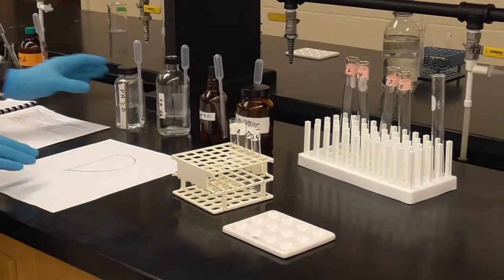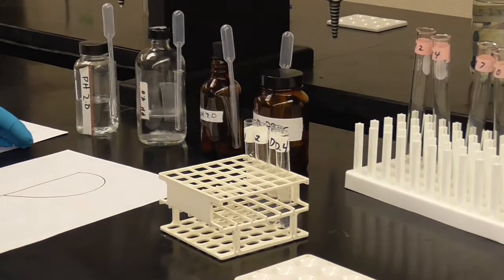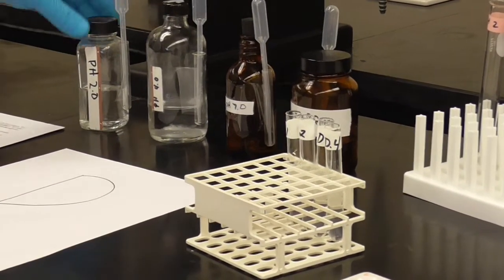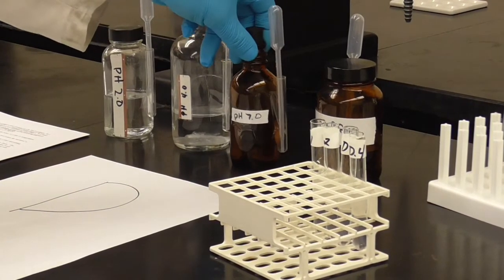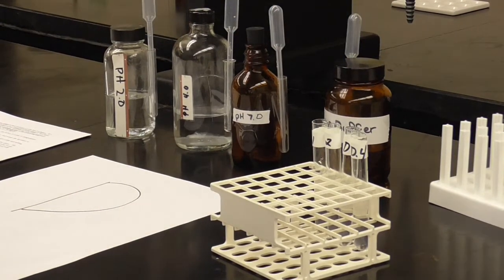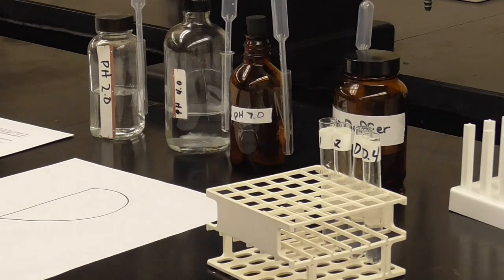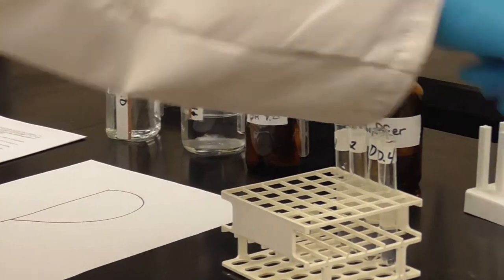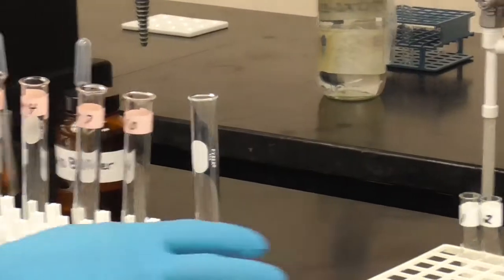Here we've created 4 different buffers. Remember, buffers are solutions that hold the pH, they resist change to pH. So we've got a 2.0, way acidic, right? A 4, which is mildly acidic, a 7, so basically at body pH, and then a pH of 10, which is basic, above body pH. How will amylase respond under these conditions? That's what we'll find out. So, step 1, we need 3 milliliters of each buffer in some test tubes. Let me joggle this around a little bit just so it's easier to grab.